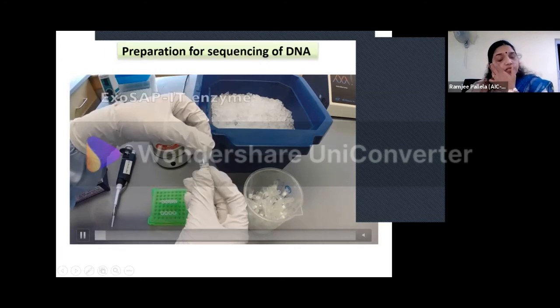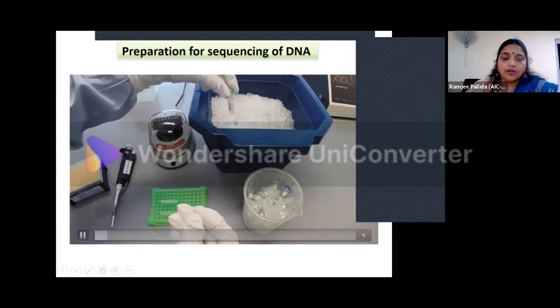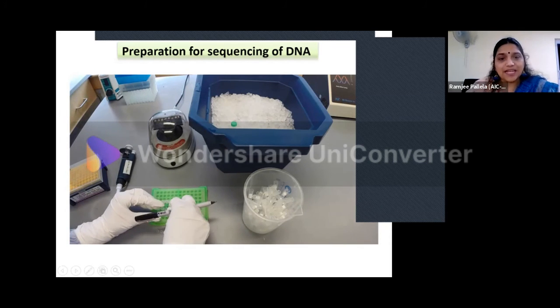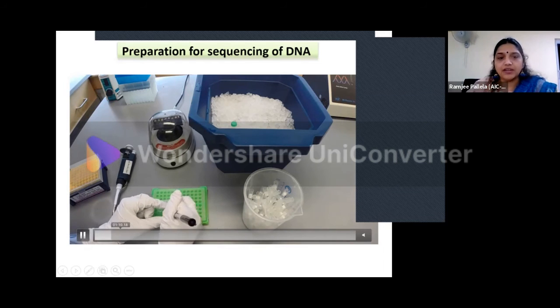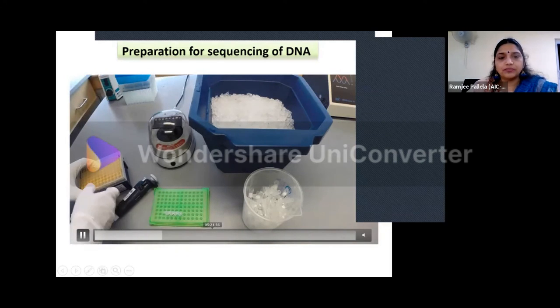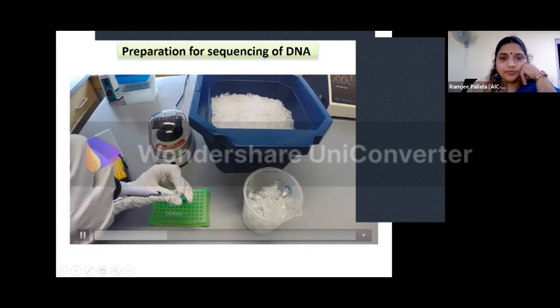When you have your amplified sequences, many of the companies also give some spin columns. This is another chemical, that is ExoSAP, or there are PCR purification kits. There will be many chemicals like that which are available from the company. So we add it to our mixture, centrifuge, and remove it later. You see, you are adding it here in your samples. Just check this.